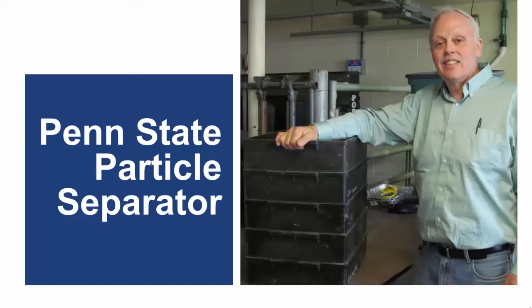The Penn State Particle Separator is used by dairy farmers and nutritionists around the world to determine the particle size of forages and TMRs. It's a popular tool because it's easy to use in the field or at the feed bunk, and it produces repeatable results from as-fed samples in just a few minutes.